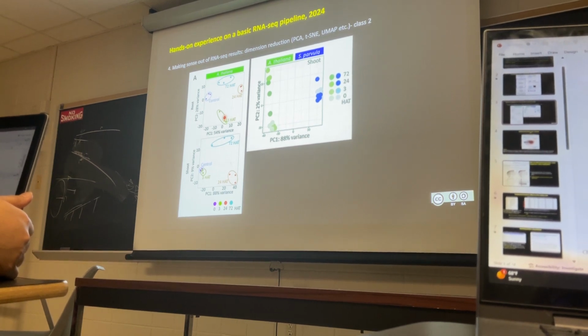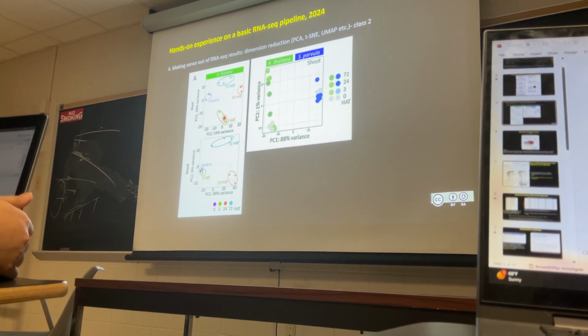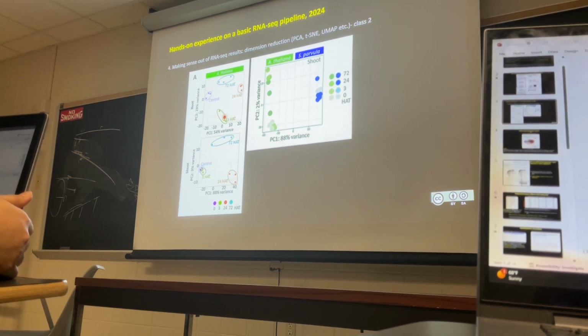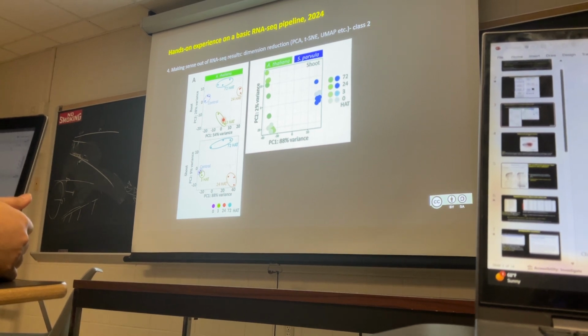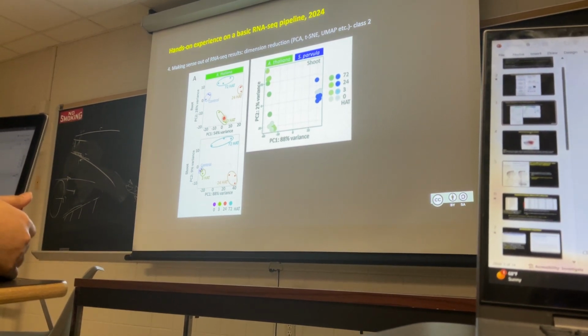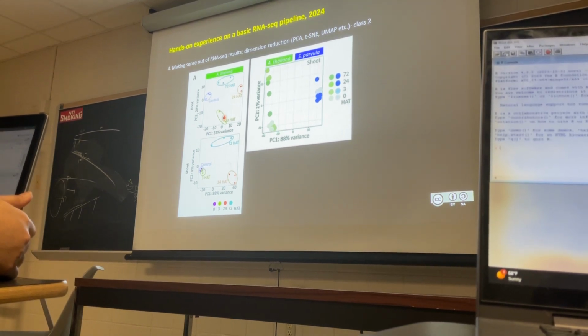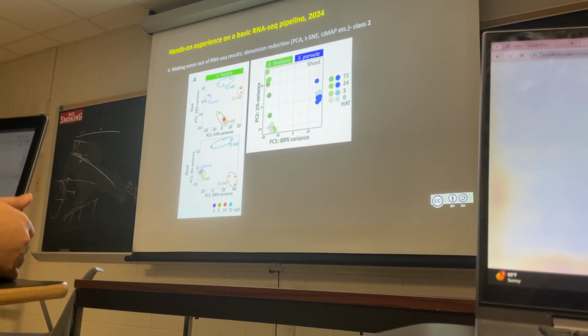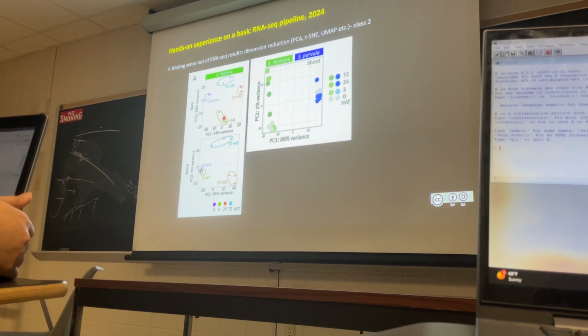But even when you have the 1 biological replicate, at that time if you use some of the statistical tool that can simulate the other replicate, so you need to use the right tool at that time. So the tool that we are using in the class, that's DE-seq tool, right, to identify the differentially expressed genes. When you use that, it doesn't simulate the replicates. So you don't have to do that.